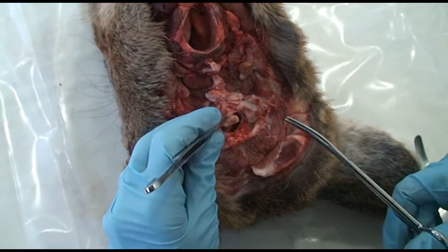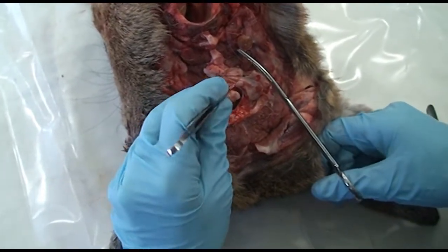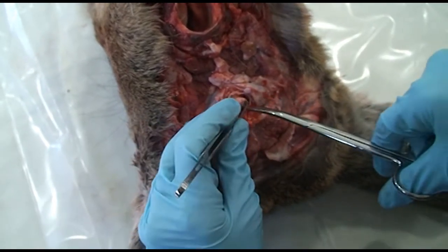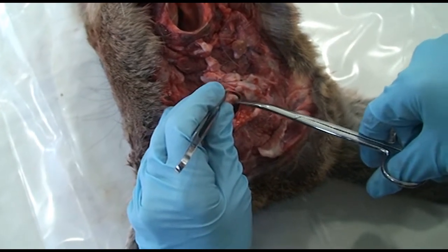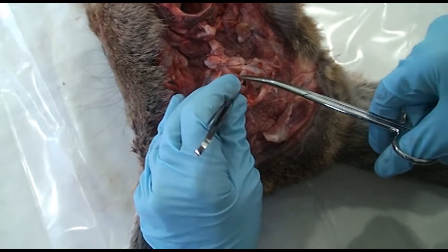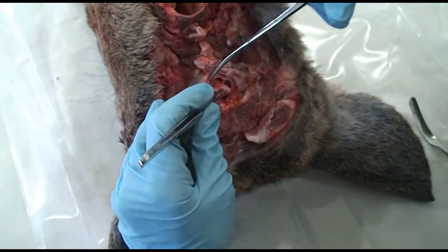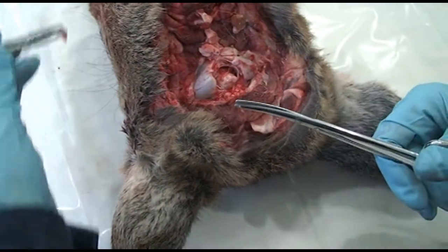So the first thing we want to make sure that you understand is this tough connective tissue that surrounds the brainstem, the dura mater. You have to be inside that dura mater. Sometimes this dura mater sticks a little closer to the brainstem and the spinal cord, and if that happens, you can get on the wrong side of it, and if you're trying to pull this out, you will make a mess and it will never come out. So sometimes I'll trim that up a little bit just to make sure it's out of our way and to show that we're where we want to be. And we'll just trim some of that off of there.